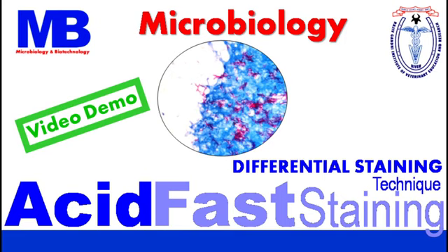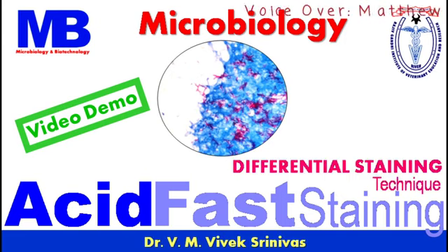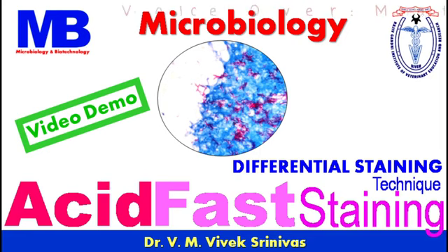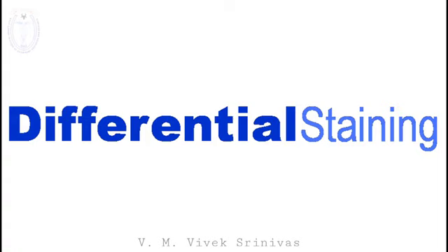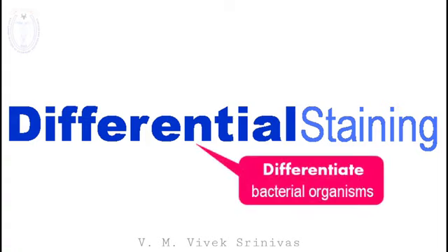In this video demonstration, we will see about a differential bacterial staining technique, the acid-fast staining. This protocol is used to differentiate and to identify the acid-fast bacterial organisms. The differential bacterial staining technique is used to differentiate the bacterial organisms.